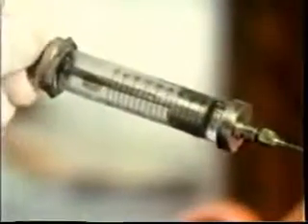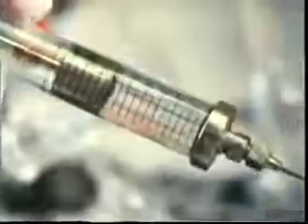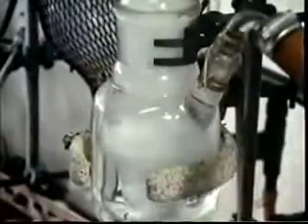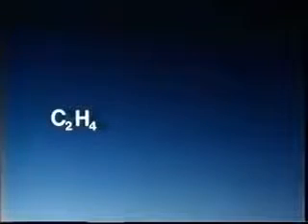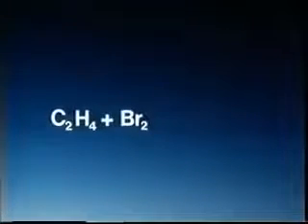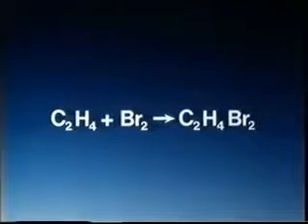This is because the bromine reacts with the ethene, joining onto it, forming dibromoethane, C2H4Br2, which is a colourless compound. With certain substances which act as a catalyst, ethene molecules will come together, joining on to each other to produce a new compound. The catalyst has to be mixed with another substance called a promoter. This is the first constituent. This compound reacts with air and moisture and has to be handled very carefully. This is the second constituent.